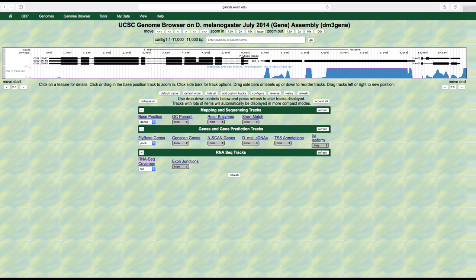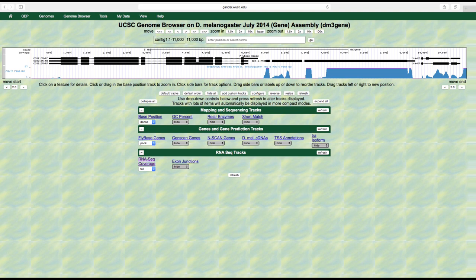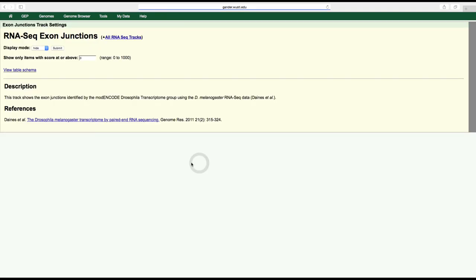In addition to RNA-Seq coverage, it is often also helpful to consider splice junction prediction data that are derived from the subset of RNA-Seq reads that span two or more exons, known as spliced RNA-Seq reads. To visualize these predictions, click on the exon junctions link under the RNA-Seq track section, use the drop-down menu to select pack, and then click submit.